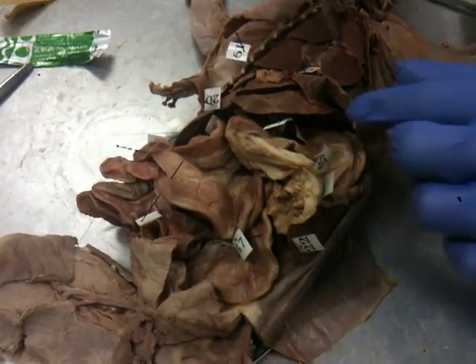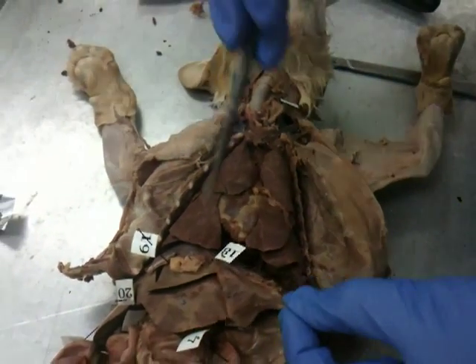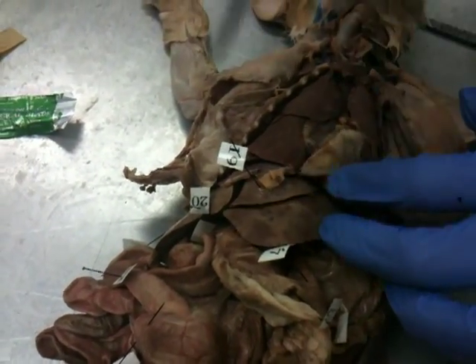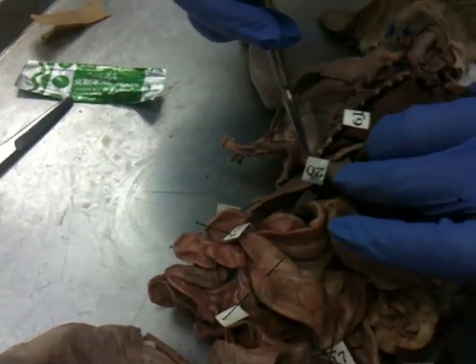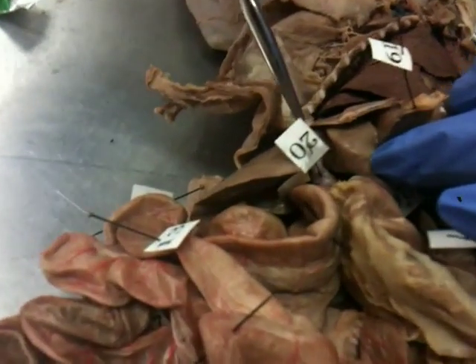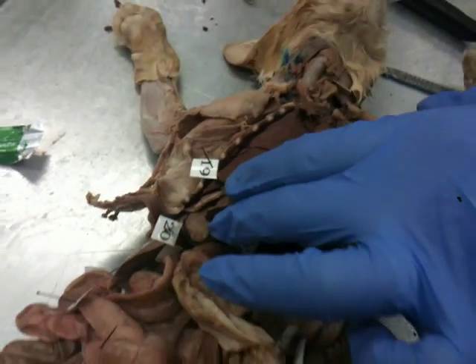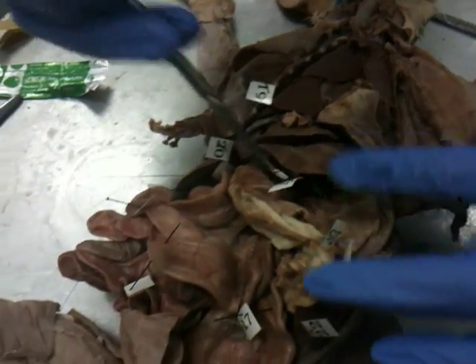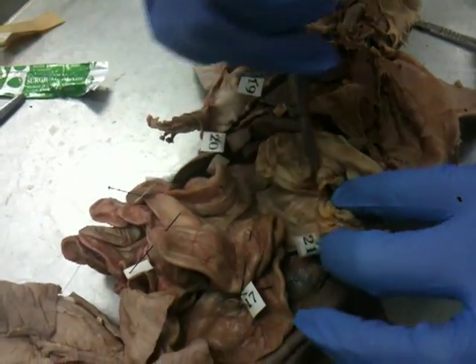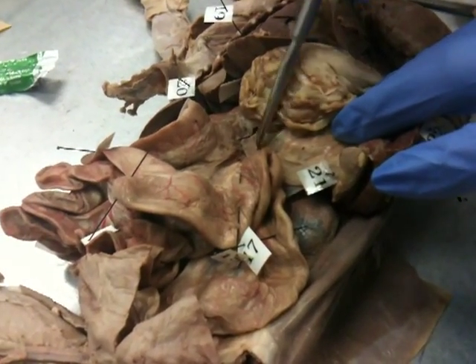Eighteen is the diaphragm — it's the flap right there. Nineteen is the liver. Twenty is the gallbladder, a little sack in there — right here. That's so tiny. Twenty-one is the pancreas, which is under the tummy.